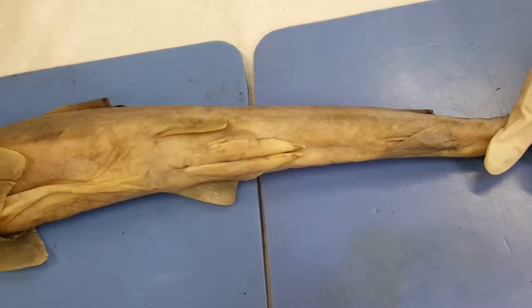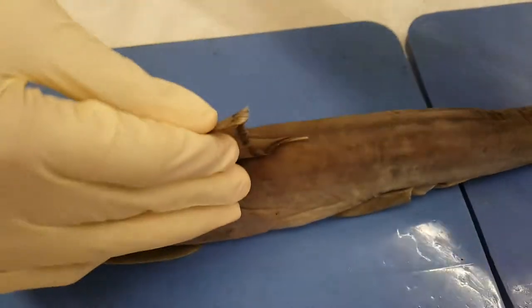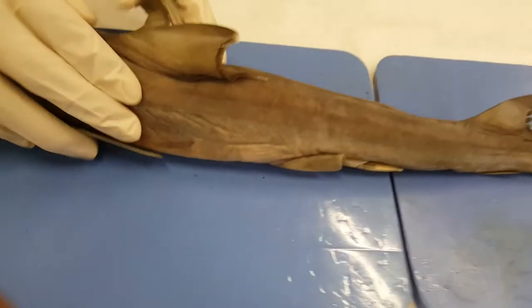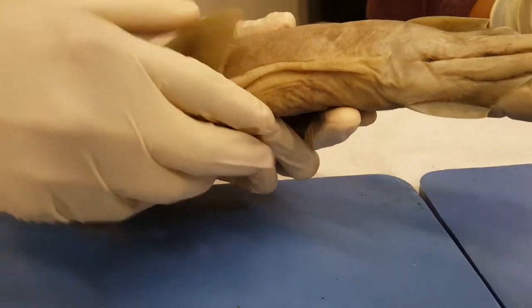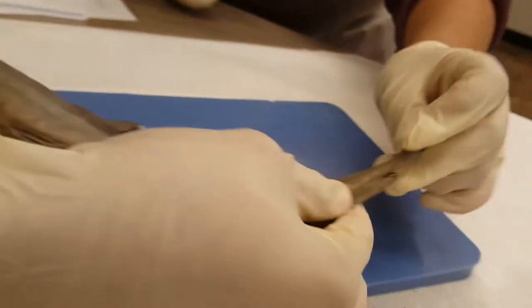Then we have our fins. We have the first dorsal fin, the second dorsal fin which is in the back, then the pectoral, and then the pelvics with the claspers, and then the caudal fin which is all the way in the back.